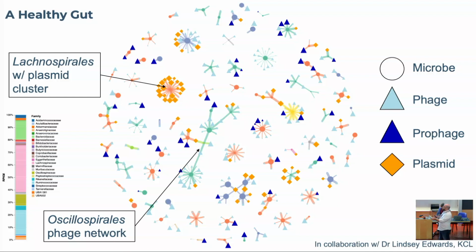And I show this because this is how we're used to looking at microbial communities, at metagenomic data. But really, your metagenome looks like this, right? That's what's actually happening inside of these communities, and we don't see that by normal sequencing methods. And so that comes into play when we're talking about the holobiome, because it's essentially the same thing, right? This is sort of like one level down.